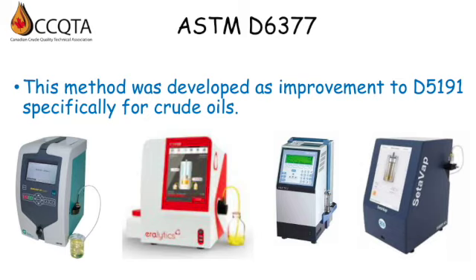Moving on to ASTM D6377, you'll notice that the instrument photos don't change from D5191 to D6377. Although some legacy instruments were only suitable for D5191, most current vapor pressure instruments are capable of running both D5191 and D6377.